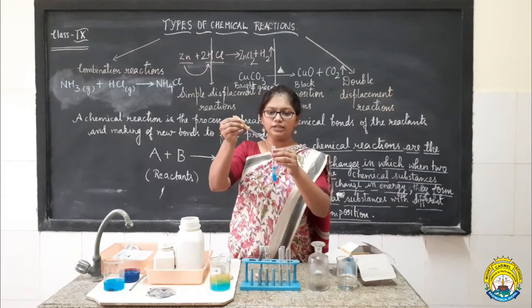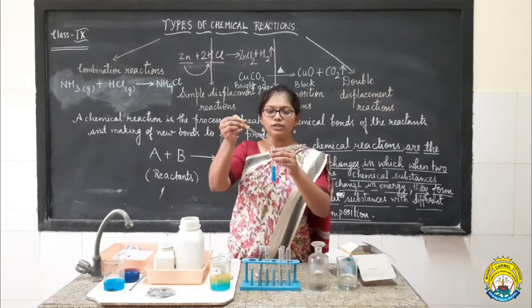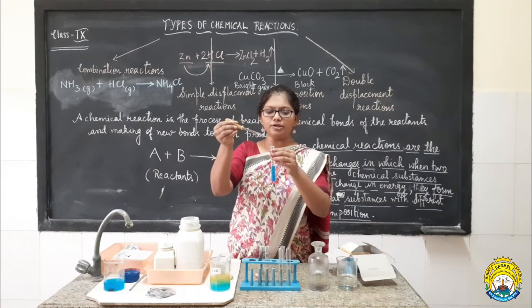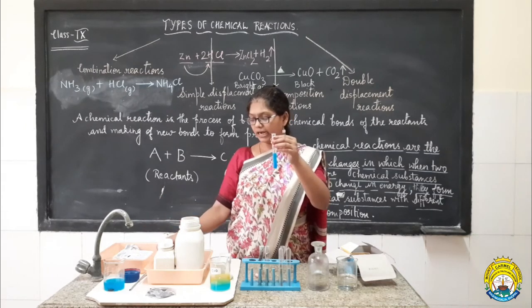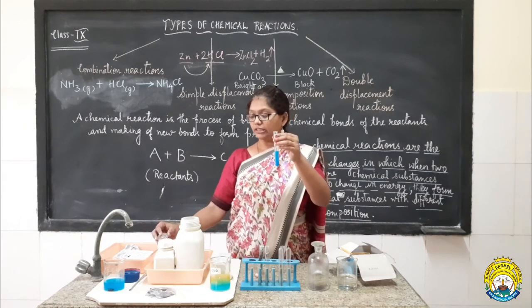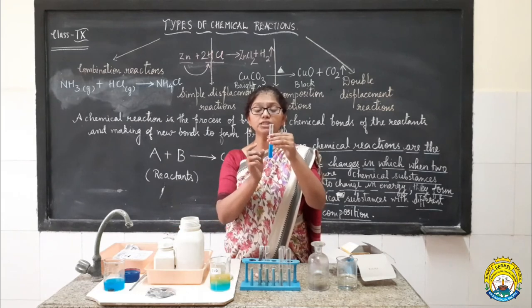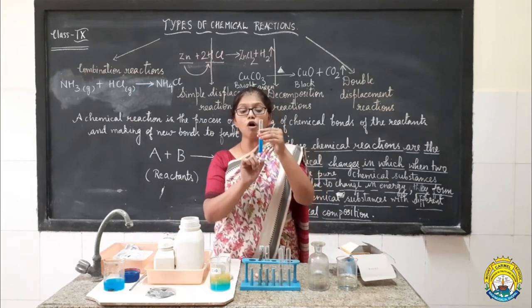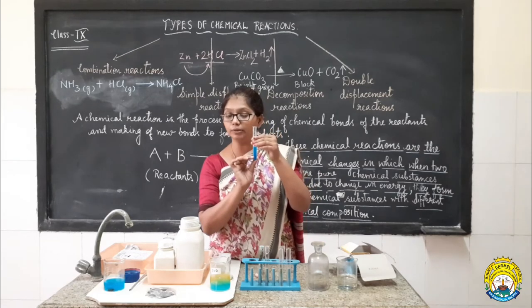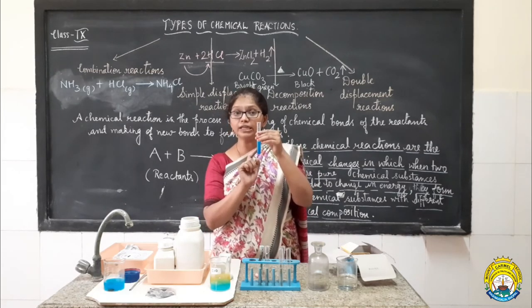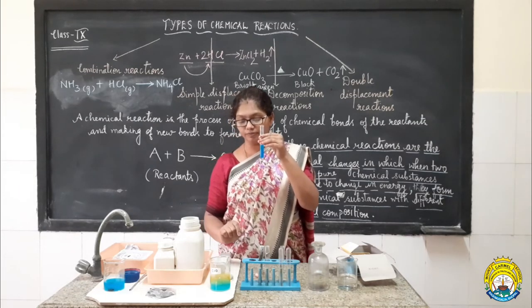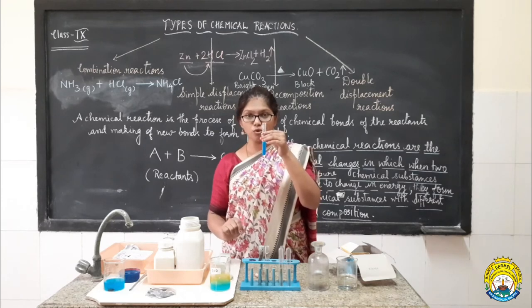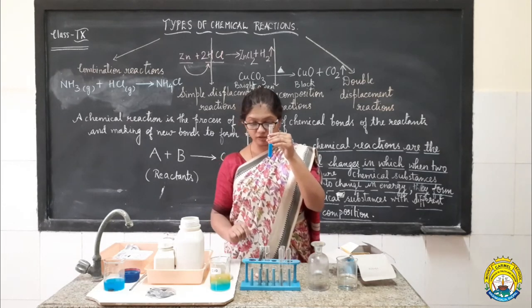Can you see this? On adding sodium hydroxide solution to this aqueous solution of copper sulfate, we are getting a pale blue precipitate kind of substance. Why am I calling this substance a precipitate? Because it is an insoluble solid product formed in the solution medium. So a pale blue precipitate of some kind of substance is getting formed here. Now how can we show this reaction, this chemical change?